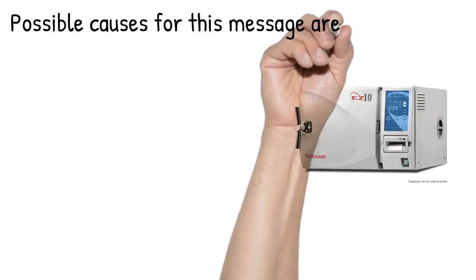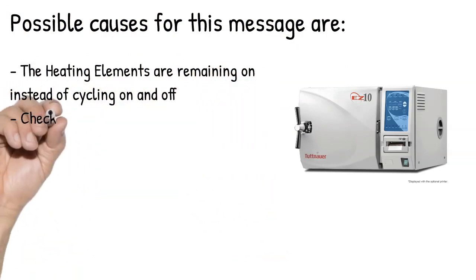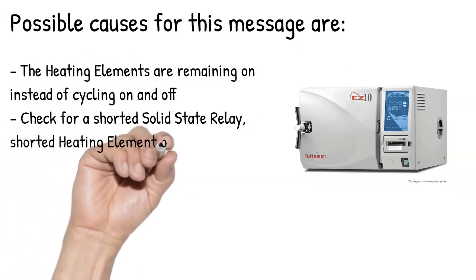Possible causes for this message are: the heating elements are remaining on instead of cycling on and off. Check for a shorted solid state relay, shorted heating element, or other short circuit.